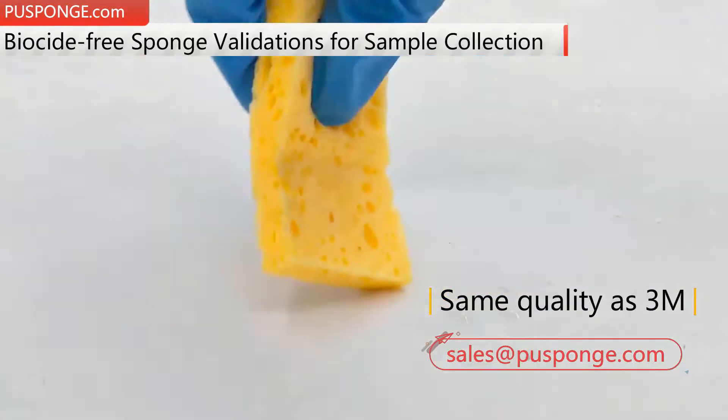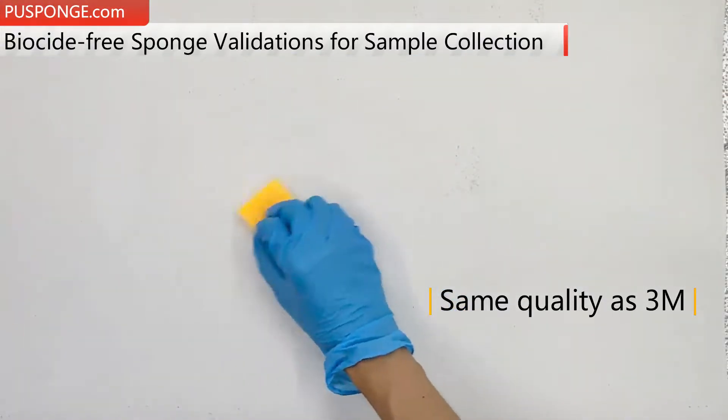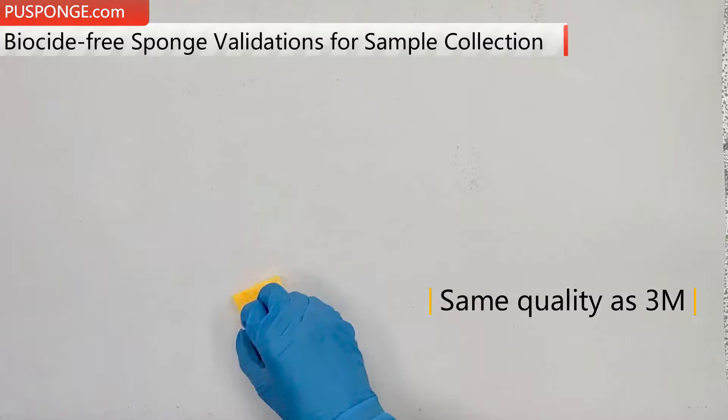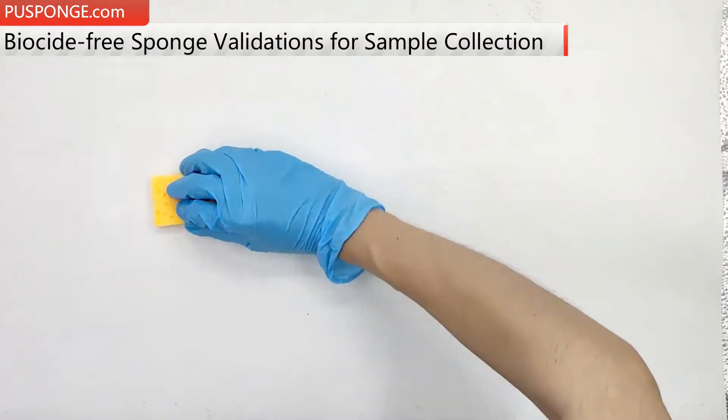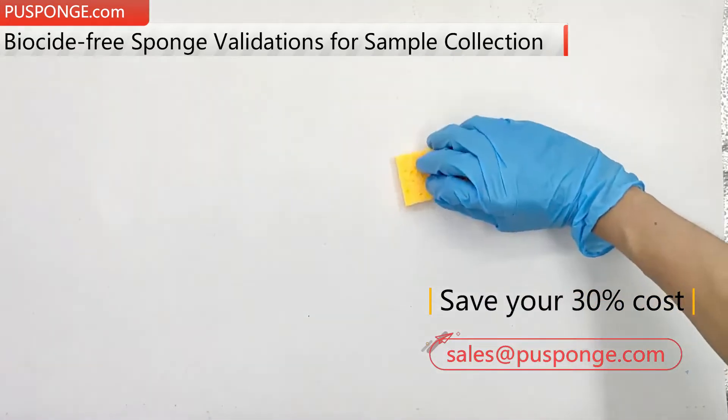Advantages: 1. High flexibility, eco-friendly. 2. Very nice absorbability and large capacity. 3. Close to the most excellent quality with the most beneficial price. 4. All dimensions and shapes can be customized.